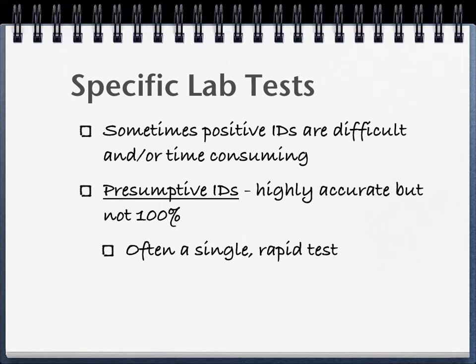So it takes you at least a day, and sometimes, and we'll see this, the test results lead you to another set of test results, which then can lead you to another test, which can make your identification scheme take up to maybe even a week, depending on what you're trying to find. And even then, two very similar bacteria may be hard to differentiate based on biochemical tests alone, right?